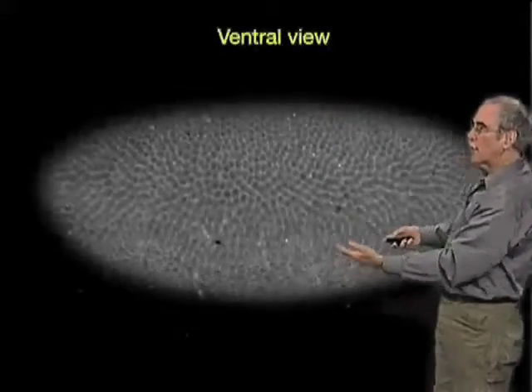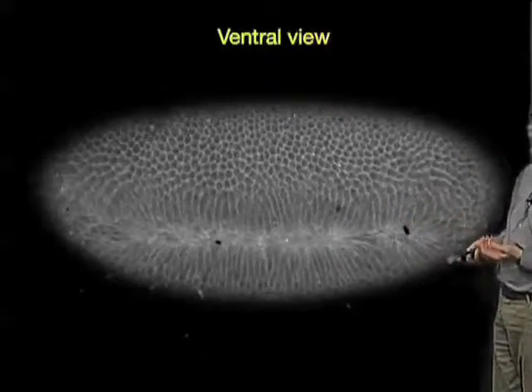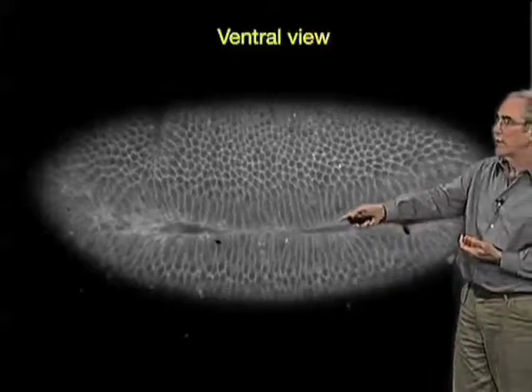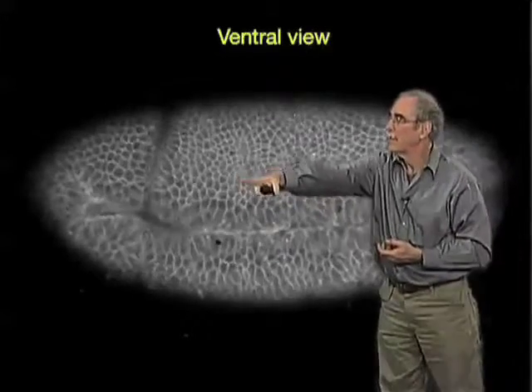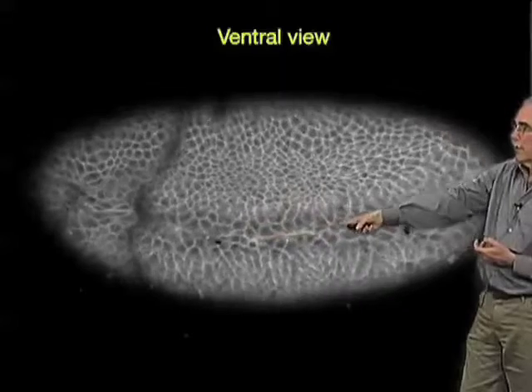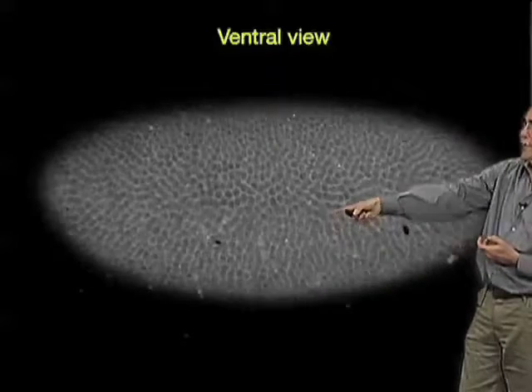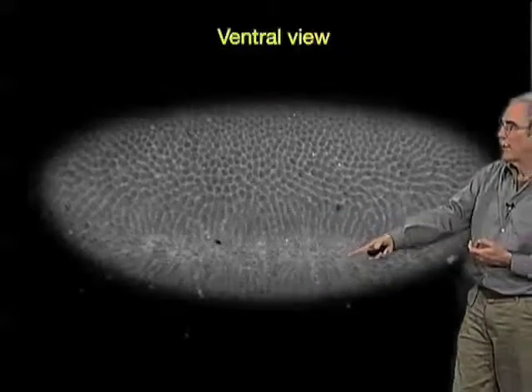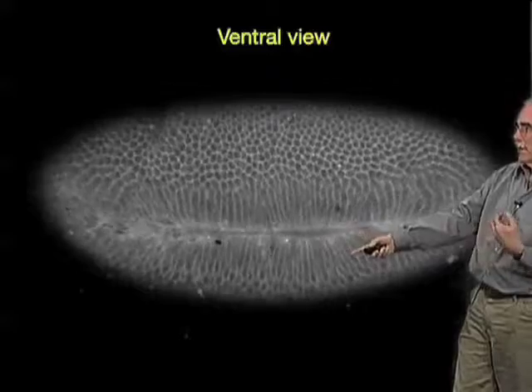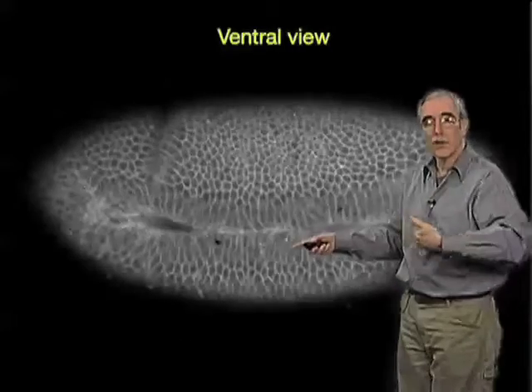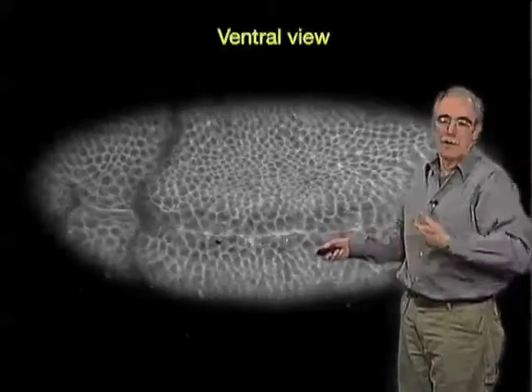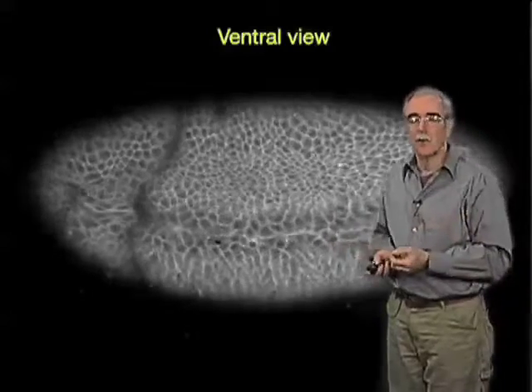We can roll this embryo over and watch from the ventral side to see that other things are going on. You can see a little bit of this head fold here, but more striking are these cell movements — watch right here, you see a fold forming. These are future muscle cells that are going to be brought into the interior of the embryo, because the embryo needs to have muscles.